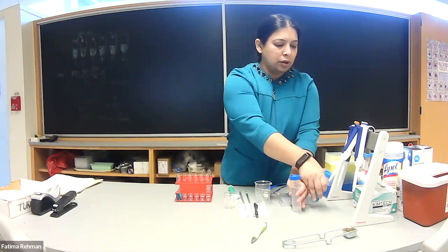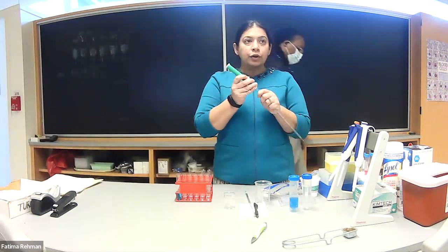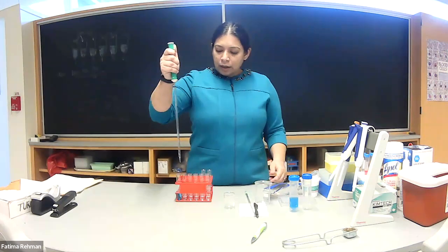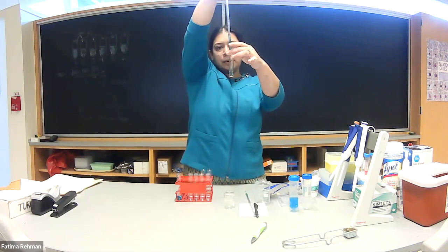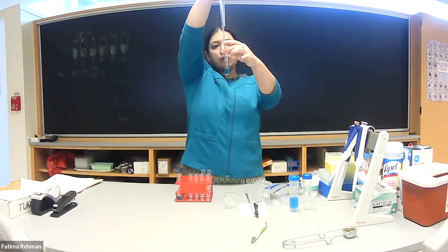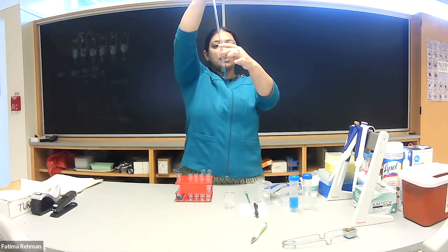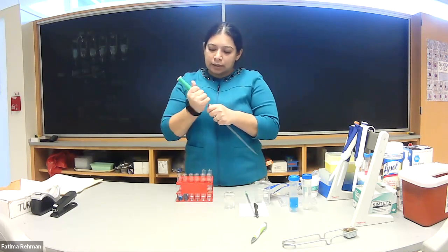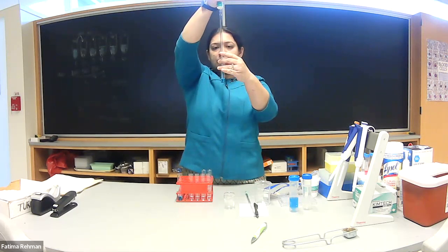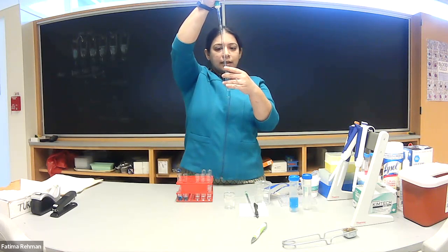Once done with the water I'll put it away. Then using the pipette for methylene blue, I take 2 ml and pick up the tube so you can see better. One easy way to mix without splashing: pick up all the liquid once with the pipette and push it back out — that mixes it very well without disturbing anything. Then take 2 ml from this tube and move it to the next, repeating the process.